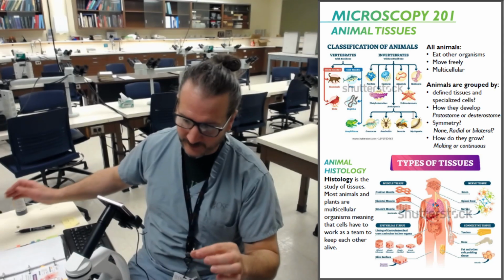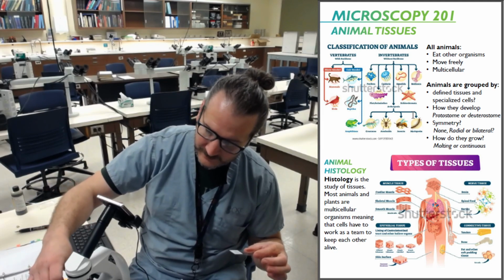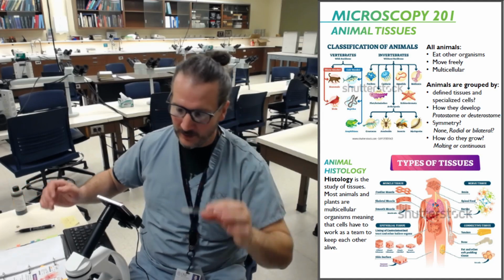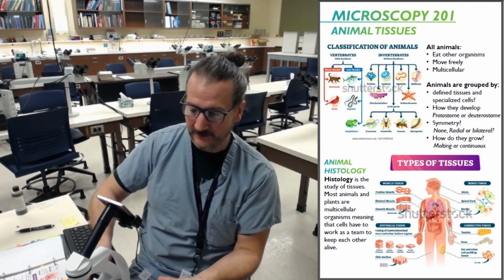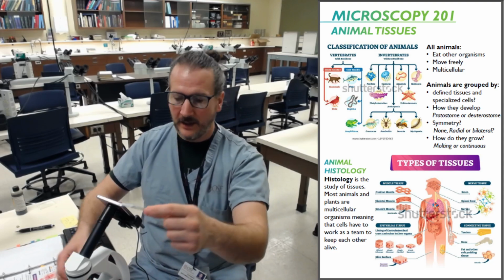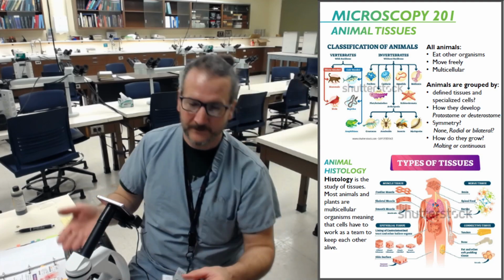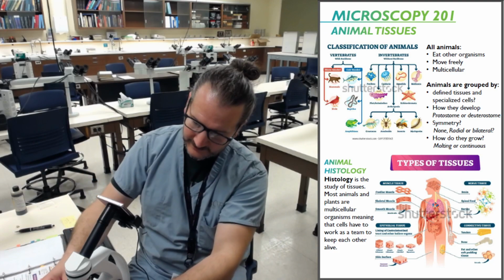So let's look at a blood smear just to get our skills all warmed up. So again, you're going to take your number 21, take your stage, lower it all the way down. I'm sorry, you can't see my stage. Mine's all the way down. I'm going to make sure that my red objective, so that would be my number 4, is the one facing down. What do we call that one again? It starts with an S.